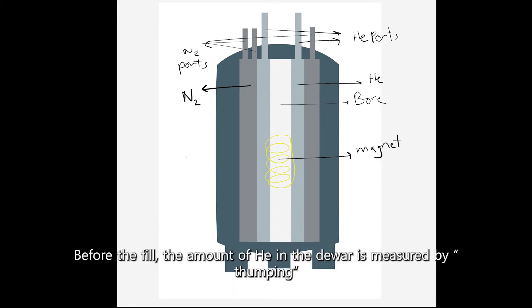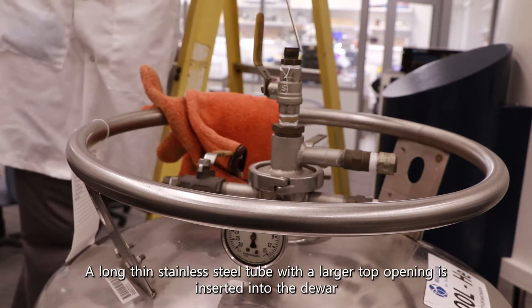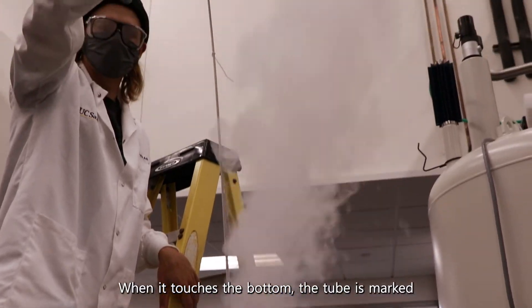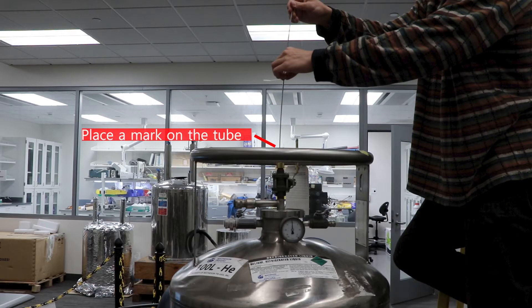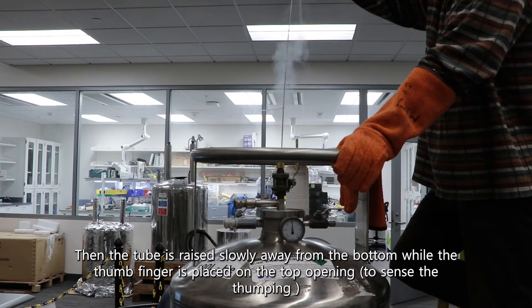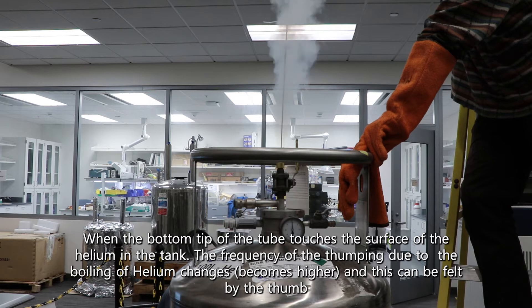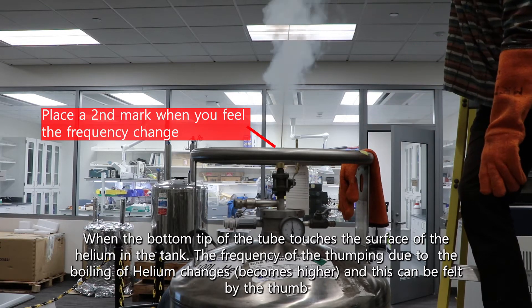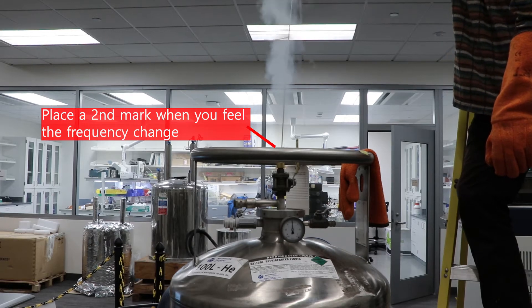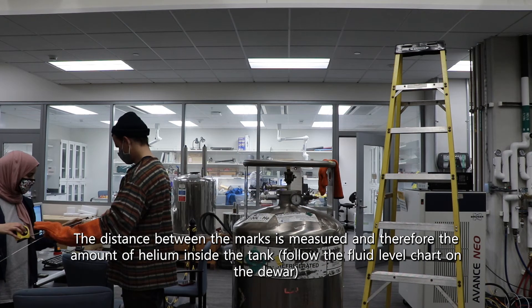Before the fill, the amount of helium in the dewar is measured by thumping. A long stainless steel tube is inserted to the bottom of the dewar. When it touches the bottom, the tube is marked. Then the tube is raised slowly away from the bottom while the thumb is placed on the top opening. When the bottom tip of the tube touches the surface of the helium in the tank, the frequency of the thumping due to the boiling of helium changes and this can be felt by the thumb. The distance between the marks is measured to determine the amount of helium inside the tank.